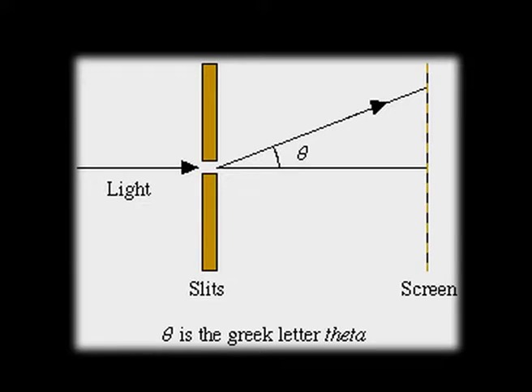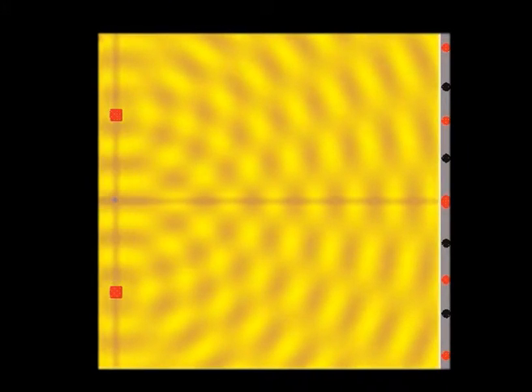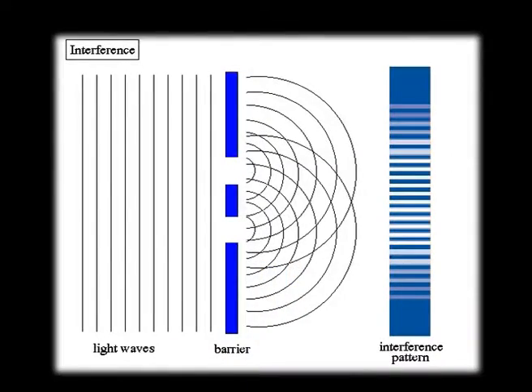Then only it will get diffracted. Now, diffraction of light can result in formation of new wavelets of light. If we are talking of different rays which are getting diffracted, because they are going in different directions, they will now interact with each other, leading to what is known as interference patterns.